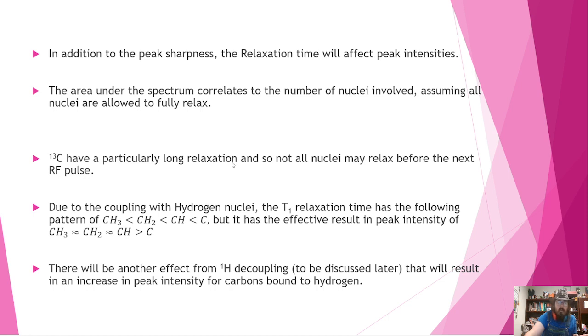Carbon-13 has a particularly long relaxation time, so not all nuclei may relax before the next pulse. Because carbon-13 will often couple with hydrogen nuclei, if there is a hydrogen bound to a carbon, we have a much faster relaxation time.